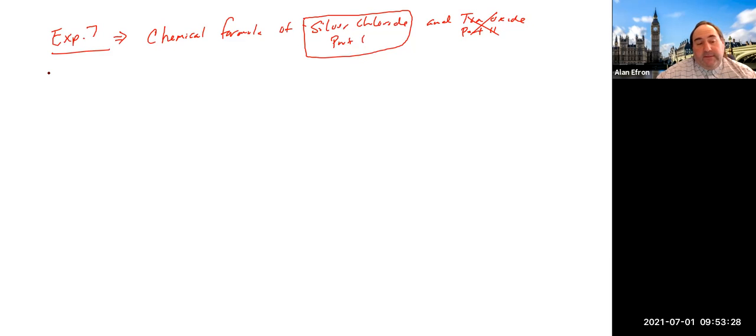It is a formal experiment. Like the hydrate experiment, this is another one of the formal experiments. So up front, like we did with that hydrate experiment, you are supposed to be using your carbon pages in the back of your lab manual. You're really only supposed to be using the procedure and the data tables that you see in the actual experiment as guides to what you should be writing in your lab notebook, your carbon pages.